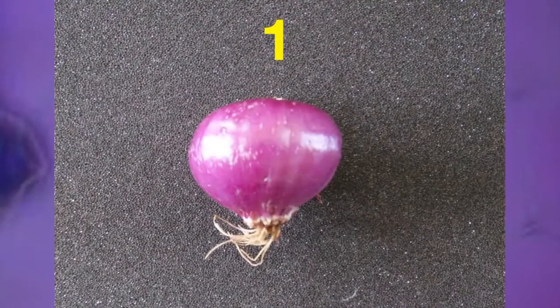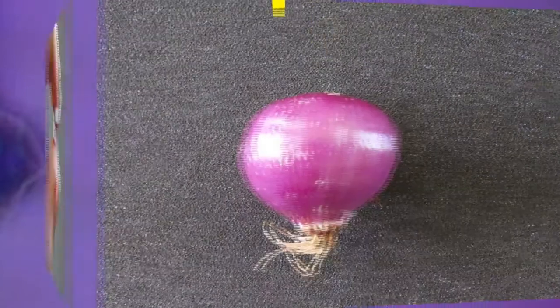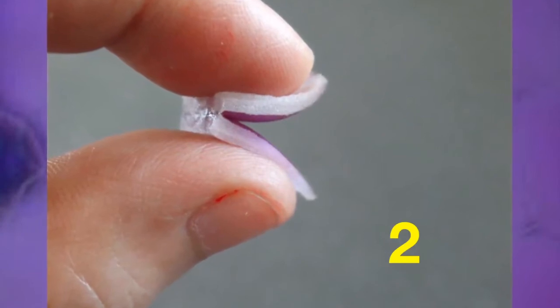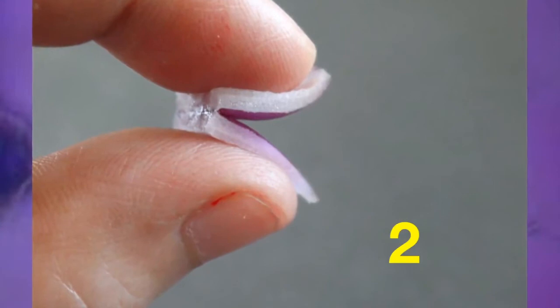Let us now see the procedure of the experiment. First, take a red colored fresh onion and remove the old layers. Now take a piece of a soft fresh layer and peel a layer of the red cells by using a forceps.